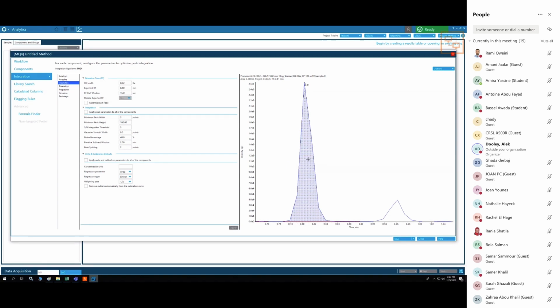So does anybody know? Let me ask a question to you all. So let's say you have a horrible peak shape, like actually this peak doesn't look very good, right? This peak looks very like a triangle. And you see that? So see these, especially down here, right? We can see there's one data point, there's another, there's a data point, there's a data point, right?